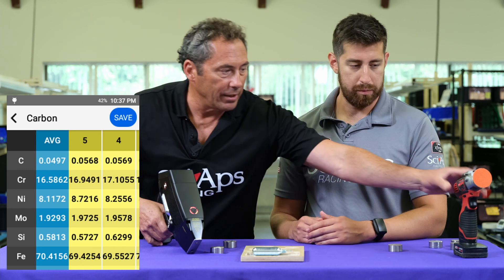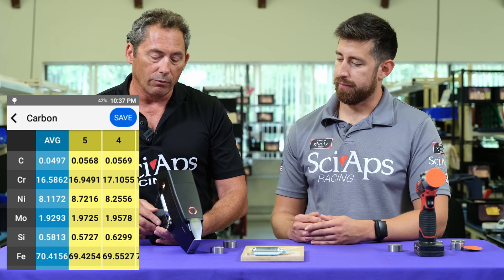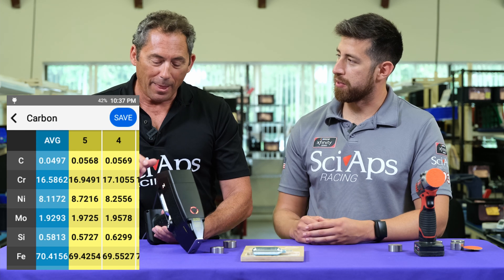With the drift correction in this, you shoot a couple of standards and it's ready to go. You're not shooting a whole bunch. Surface prep is the key — grinding that sample and making it a very clean surface is really critical. Surface prep is the most important.